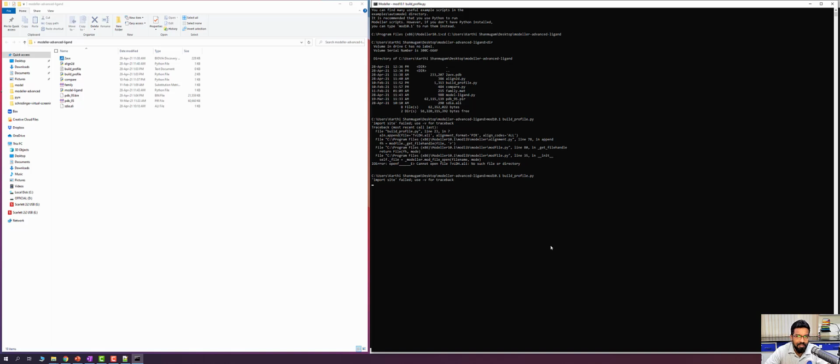So it actually takes time because it has to compare the target sequence with all the sequences which are present in PDB95. So PDB95, it's a very big file because it contains all the protein sequences for which the structure is deposited in the Protein Data Bank. So it may take some time, and we wait for the output.